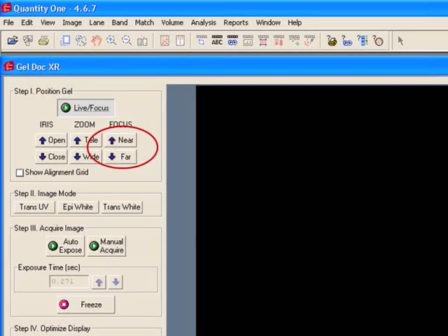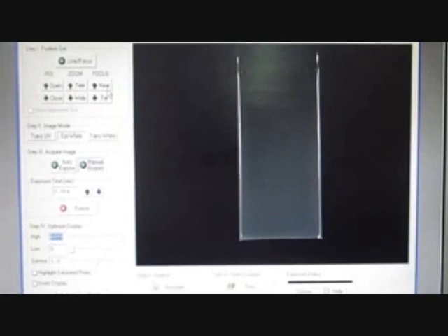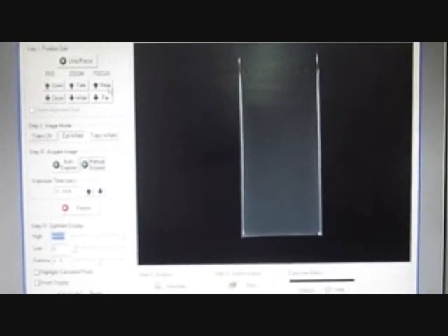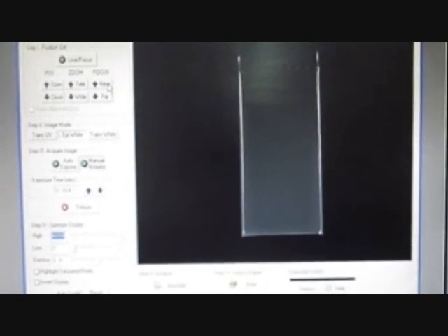The image of the gel is focused to desired amount using the near and far option until a point where the wells in the gel are seen clearly.